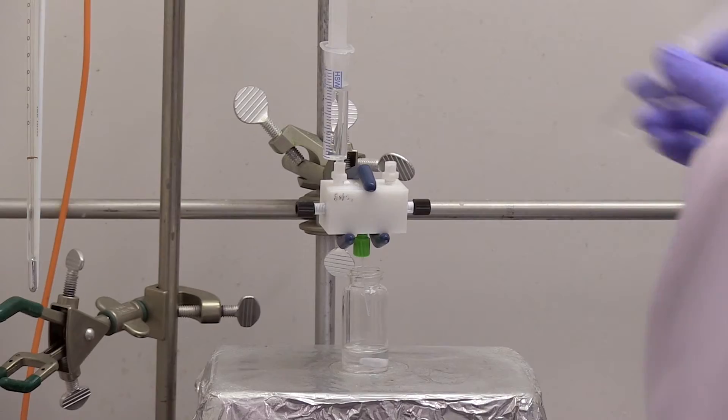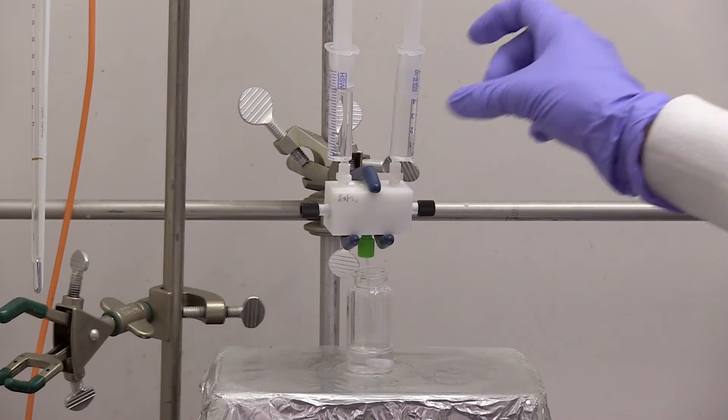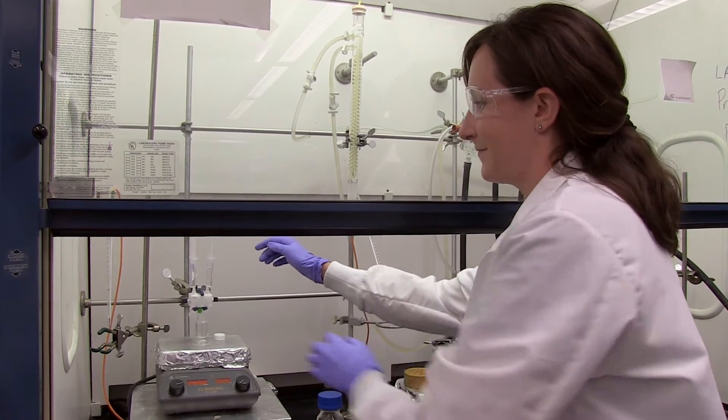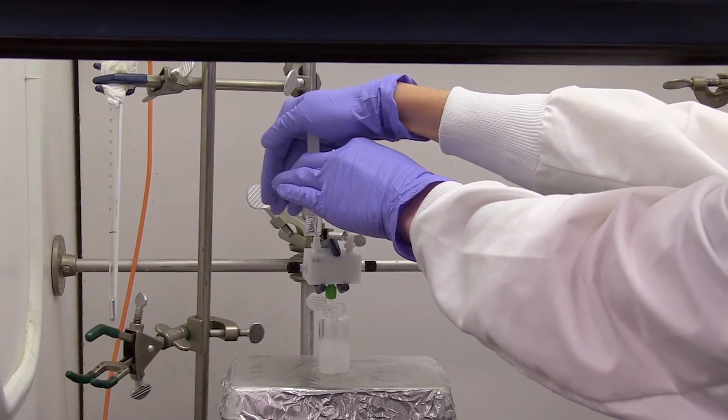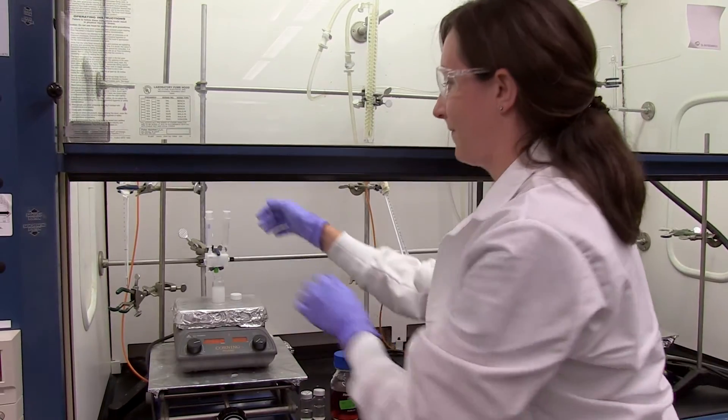We're actually able to generate quite a bit of Janus particles as illustrated by this dispersion here. We have two syringe pumps that we manually inject to get very high mixing speeds that we then subsequently precipitate out polymer Janus particles.